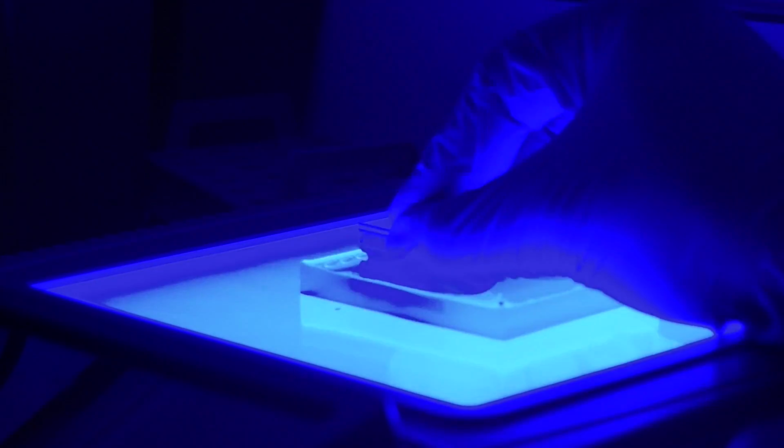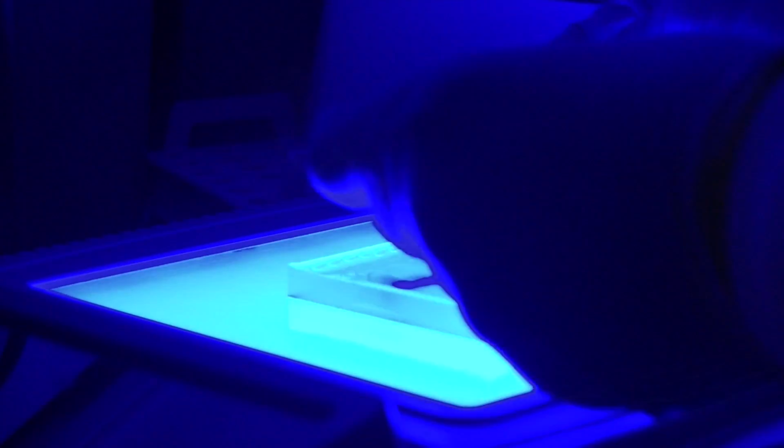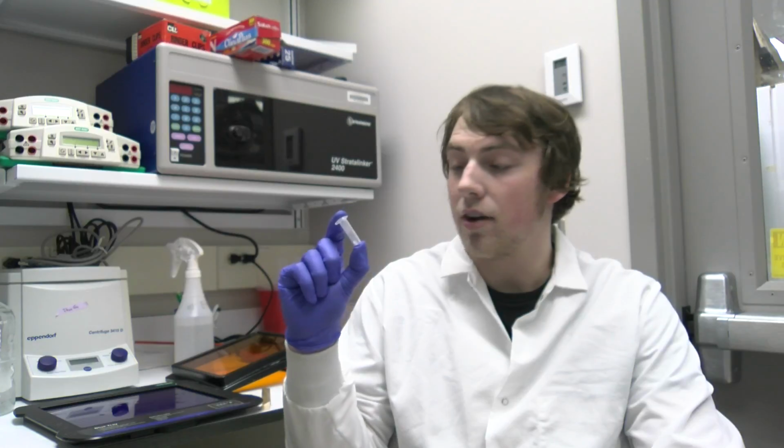Now, cut the band that we identified as the correct one in the image with your razor blade to isolate it. Now that we have our cut gel, we have successfully amplified and extracted a piece of DNA. However, the job isn't done here. To fully purify a DNA fragment, you will need to use some kind of gel purification kit.